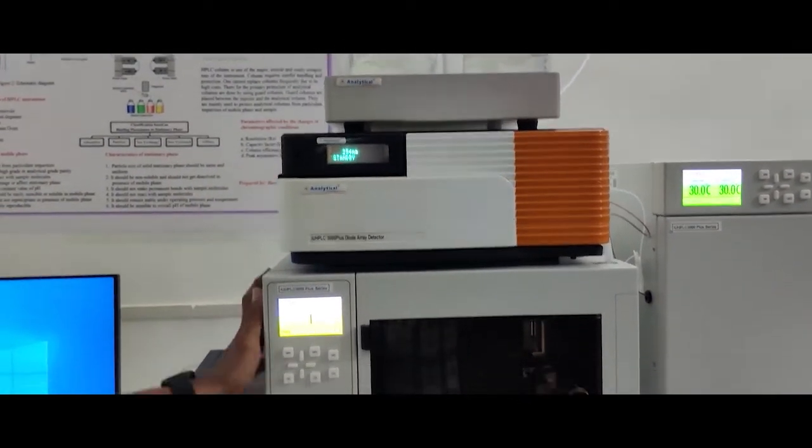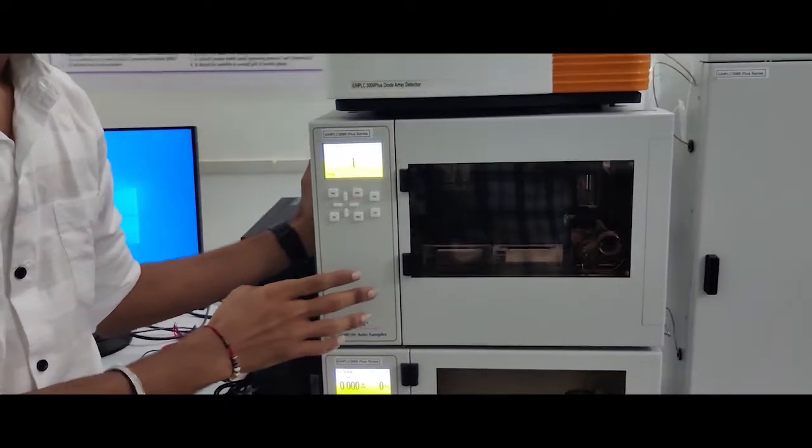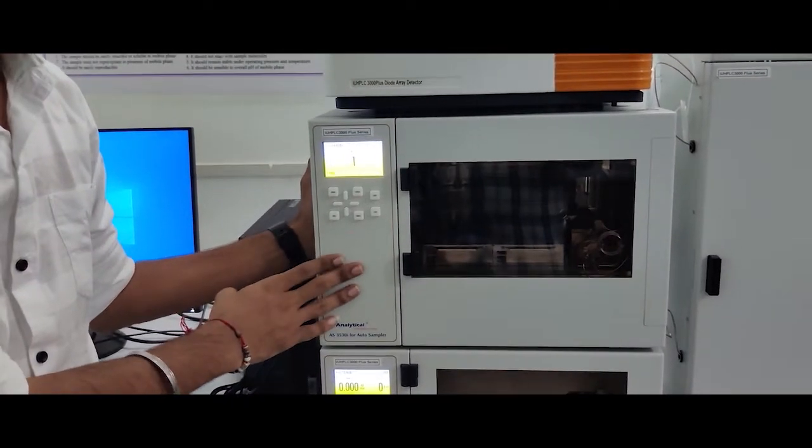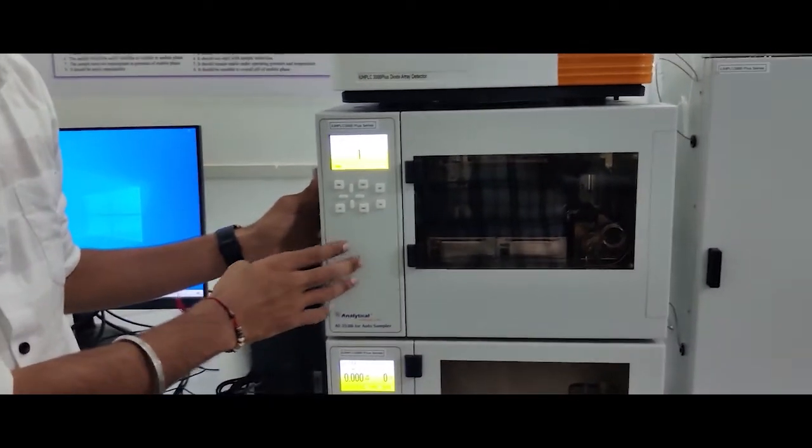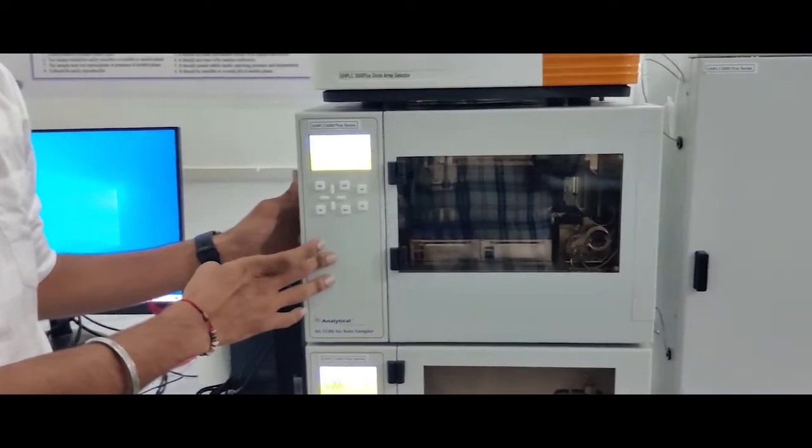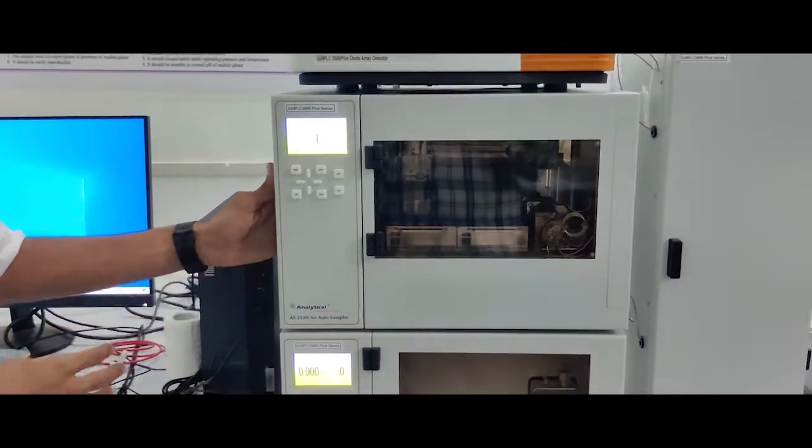Autosampler for heating. Autosampler for injecting samples with heating cooling system.